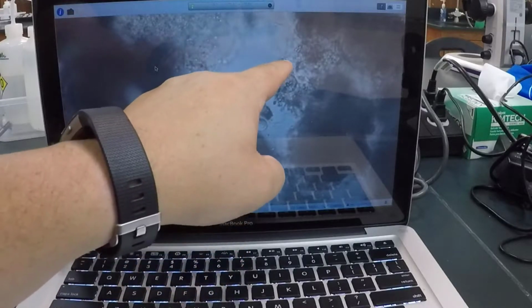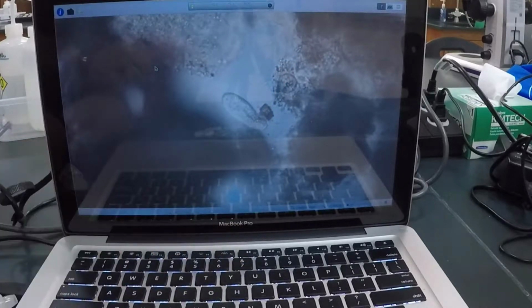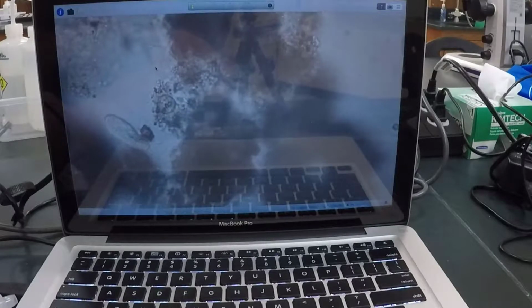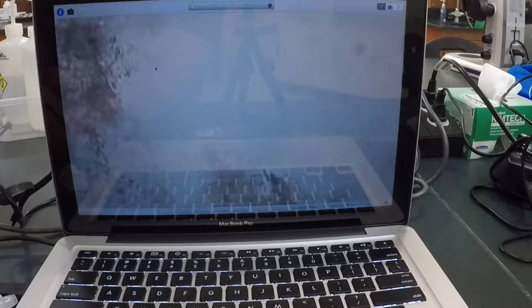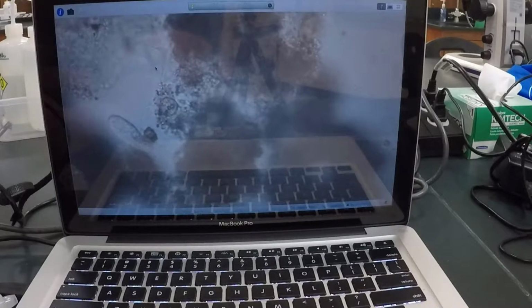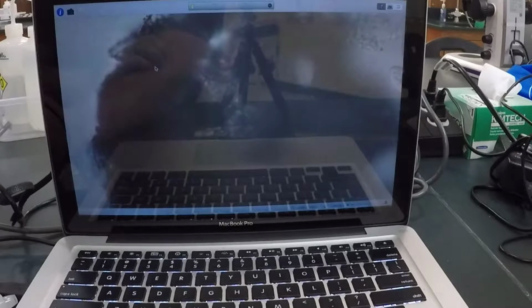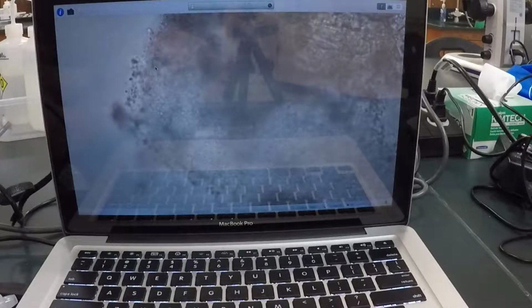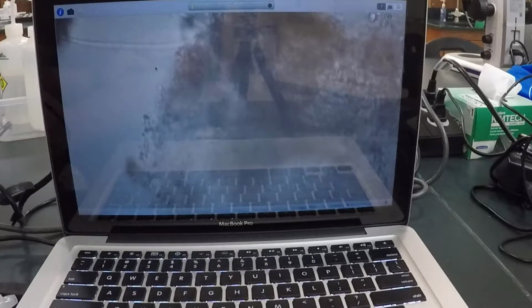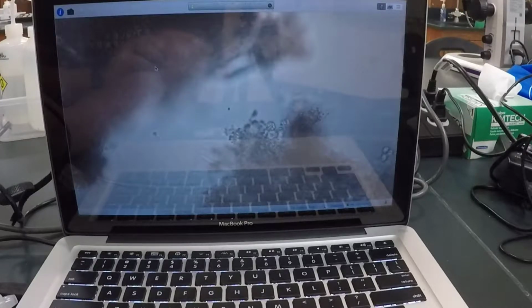And you can see some other things moving up here, some long structures. Sometimes we get nematodes and other things, oligochaetes, so worms that occur in these freshwater pond samples and things like that. So let me move around and see if I can see something else.